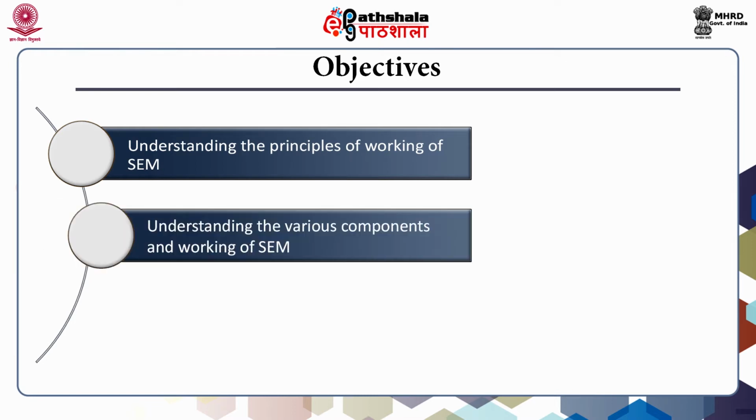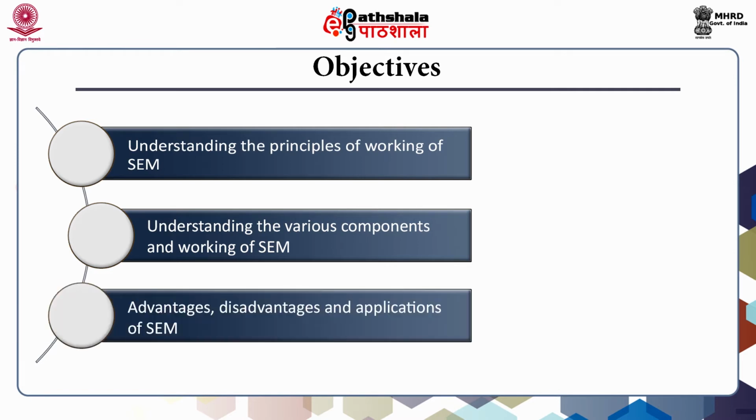The lecture will provide details on the working principle of this particular technique and the instrumentation setup and working of the scanning electron microscope. Lastly, we will also look at various advantages and disadvantages of scanning electron microscopy.